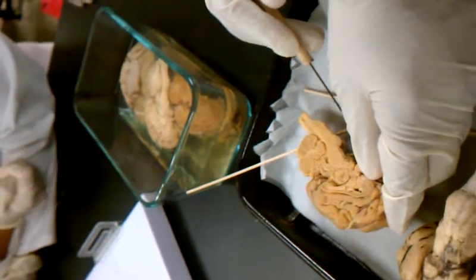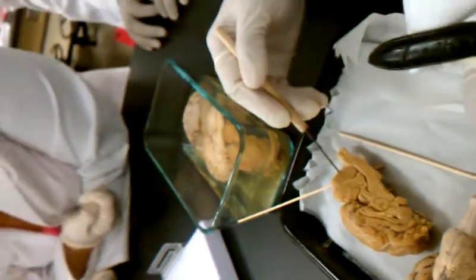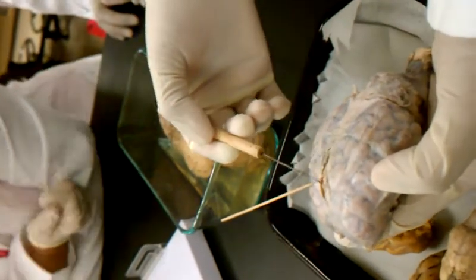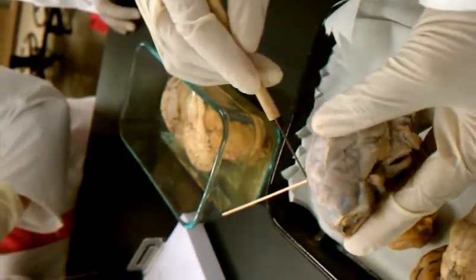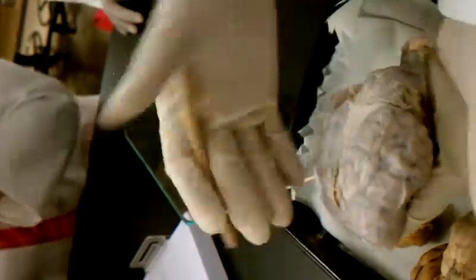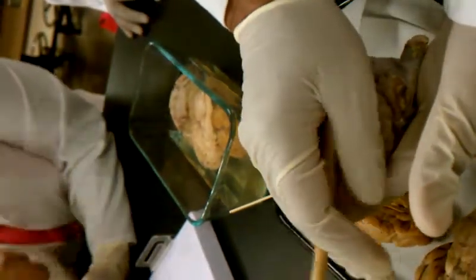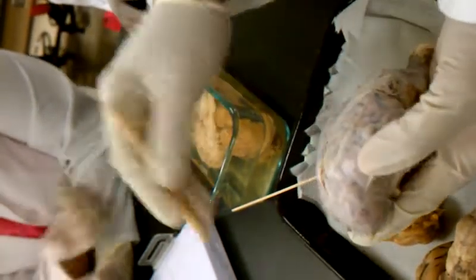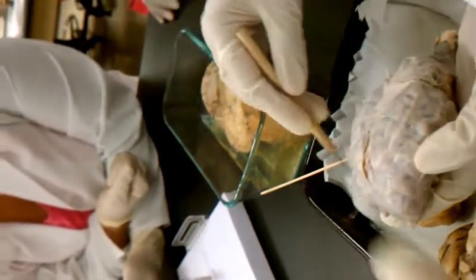The dura mater. This membrane. See? This is dura mater. Arachnoid mater is the inside layer. The inner layer? No, this is outside. It's a dura. This is dura mater. Arachnoid mater is on the inside, and the pia mater is the brain itself. So that has all three layers?